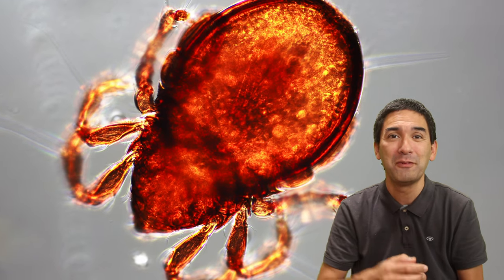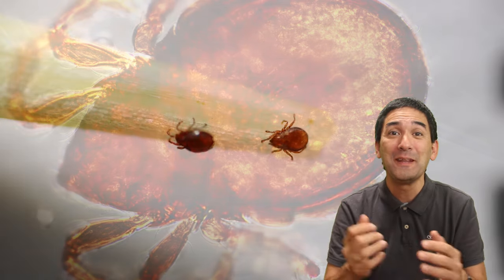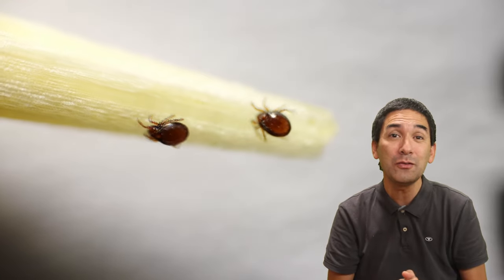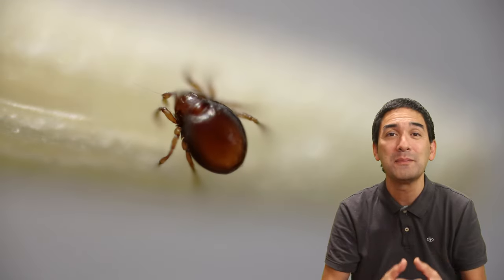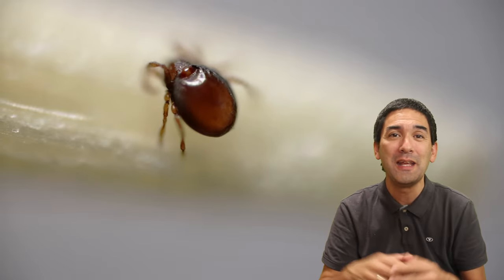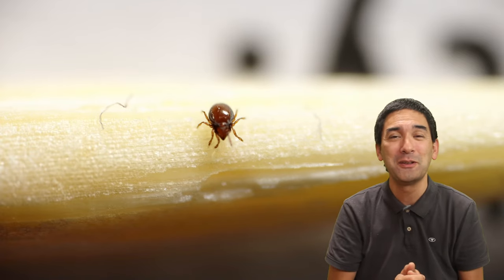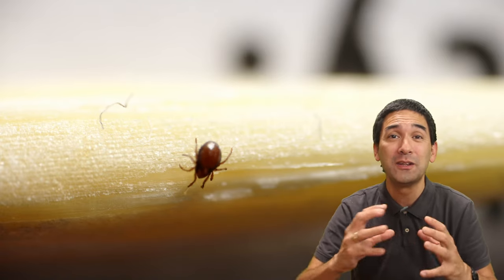This here is a photograph where I simply added a little zoom and rotation to make it more interesting. I think they look quite nice also when they move around. Here again we see the tip of a toothpick — I did not use a stereo microscope in this case, but rather I put the toothpick with the mites directly under my 4x and 10x microscope objective and used a flashlight from the top to illuminate them. I could see that sometimes they started to move away and crawl towards the shadows, so maybe they were trying to avoid the light — an interesting experiment to do as well.